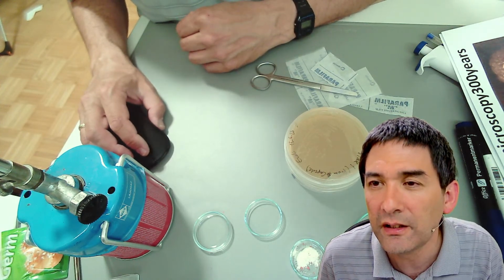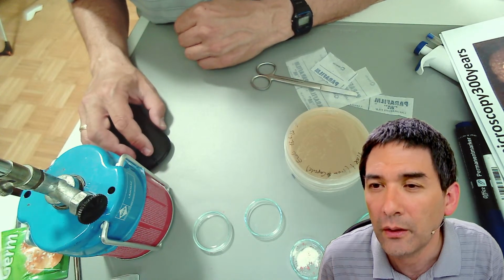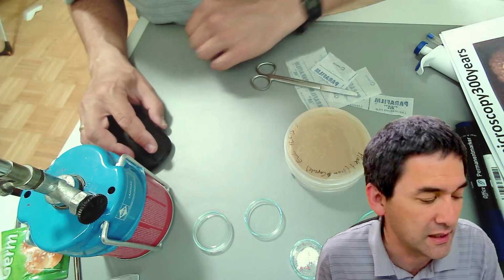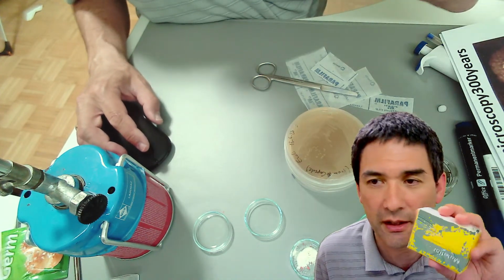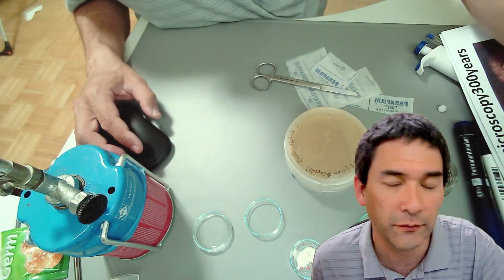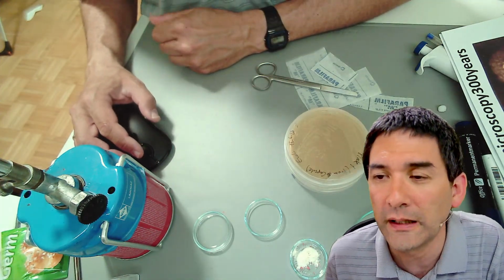So, staining bacteria. Just a second. Oh, I kind of lost where I am. Where can I find E. coli? Naturally, you can find it in the intestine, but in this case, I got them over those capsules that I bought. Or you can try to order them from a cell culture organization, but they might not send it to you because you're not a laboratory.